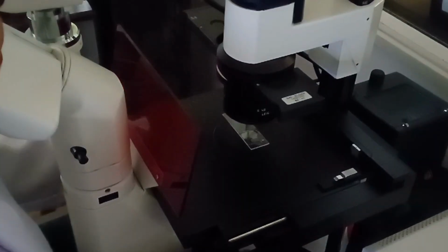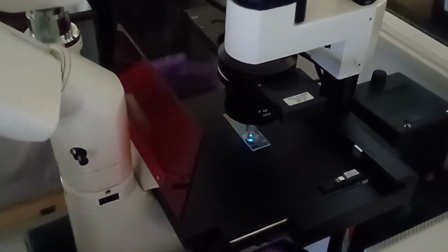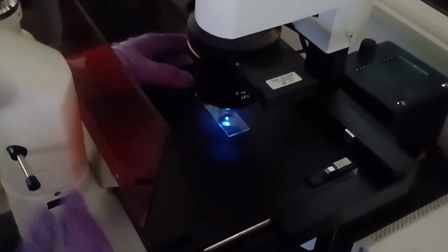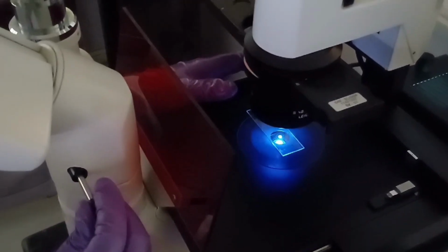Now we are visualizing the cells in the fluorescent microscope, and we can observe the presence of the protein cancer biomarker in the nuclear region of the cells. When visualizing under the fluorescence microscope, you can detect and localize the presence of the protein cancer biomarker in the nuclear region, which is an indication that it is a nuclear protein.